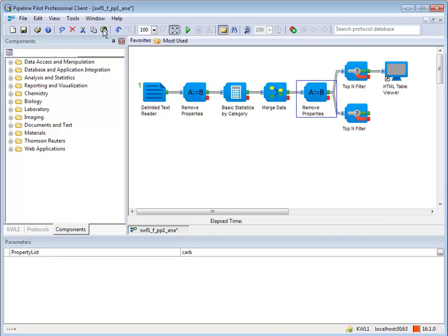As you have observed, numerous input pipes and output pipes are allowed to flow the data into and out of a single component.